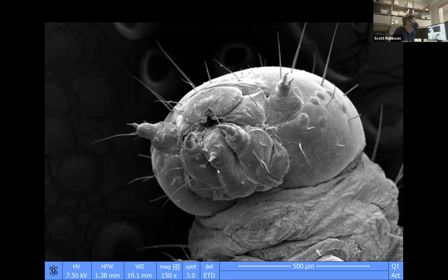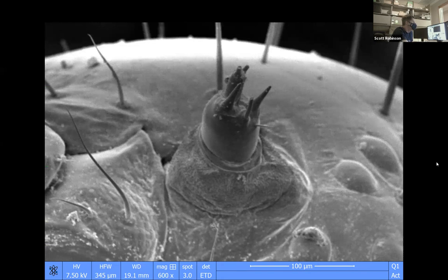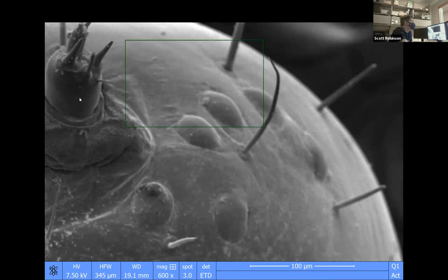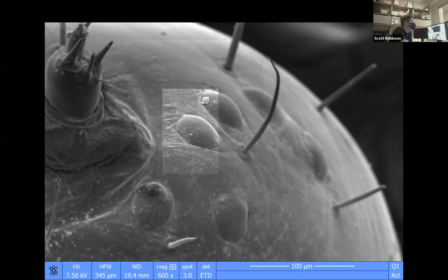And then so we can see the mouth parts. We can see the little palps. We can see these little stubby antennae on the head, like this right here. And then we can see also that they have eyes. It looks like six eyes right here on this one side, so presumably there are six eyes on the other side as well. It's the labrum. Oh, okay. But they do have what's called a frontoclypeus. It's just the part of the head behind that.